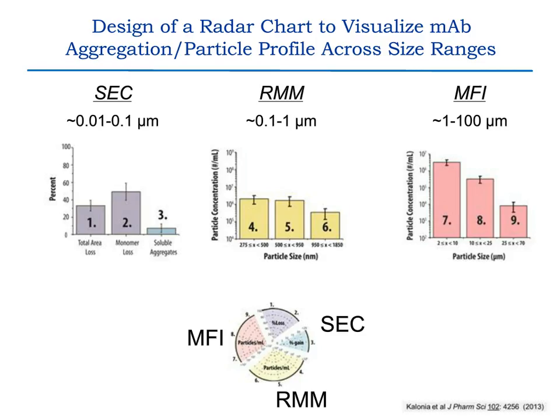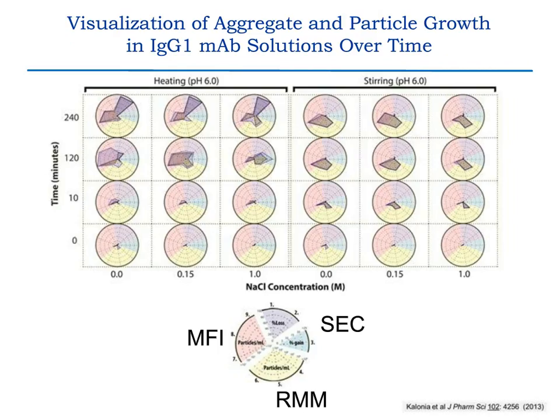And this is highlighted in the next slide, where we took an antibody solution. We looked at different stresses, heating and stirring, shown on the top. Different time periods are shown on the y-axis, with different amounts of salt, and we can see visually very quickly differences in readouts from the different instruments, which gives you an indication of the size profile changing depending on the stress as well as on the formulation as well as a function of time.